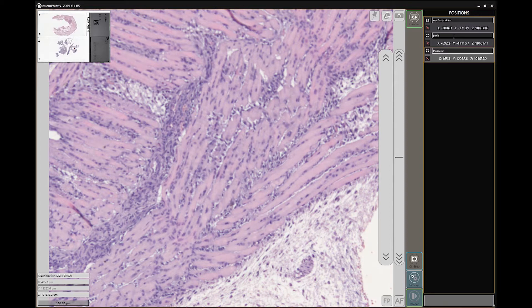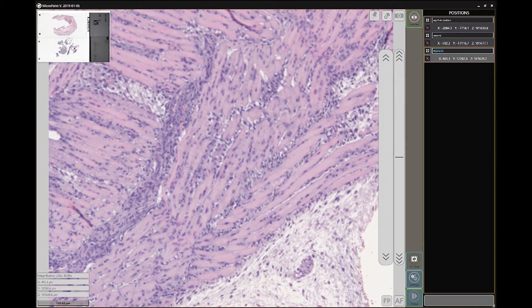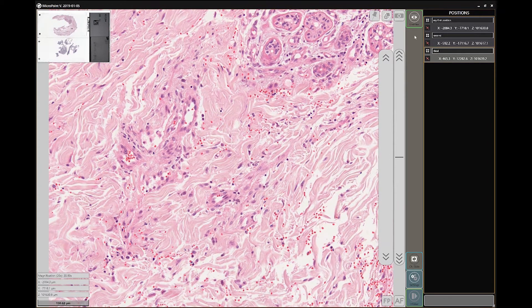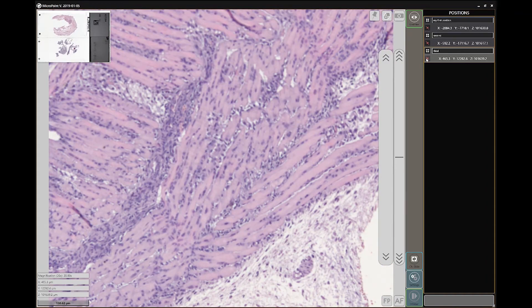You can also rename the position, and if you want to delete the position, simply click here.